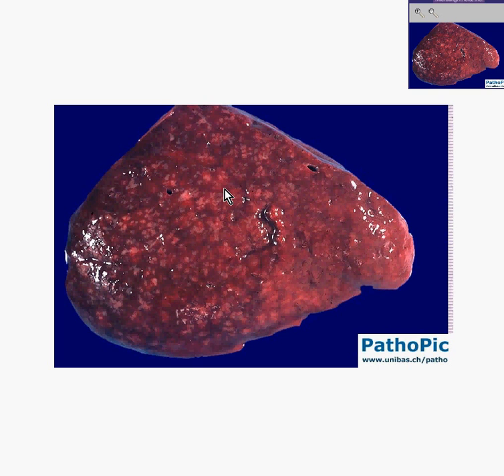Please note that the classical spleen is always described as red pulp and white pulp, and the redder areas represent areas where there are more sinusoids, the site of RBC destruction, and the whiter areas generally are the areas surrounding blood vessels, which are more likely to have lymphoid tissue. There are a lot of little white pulp areas here, aren't there? There are very little here.